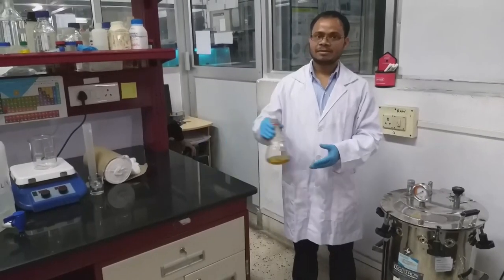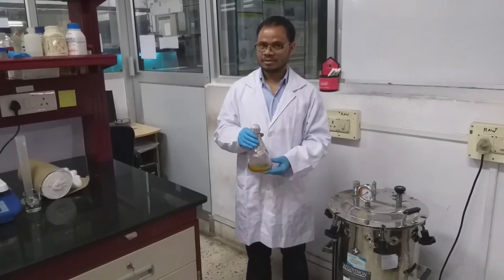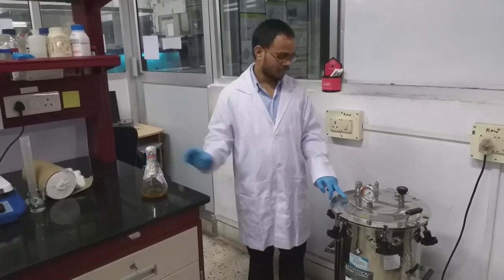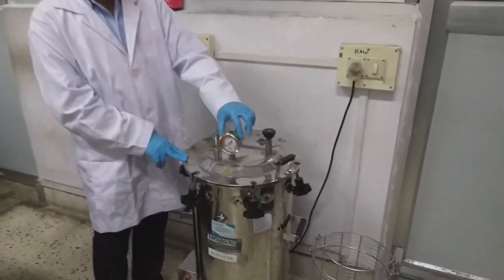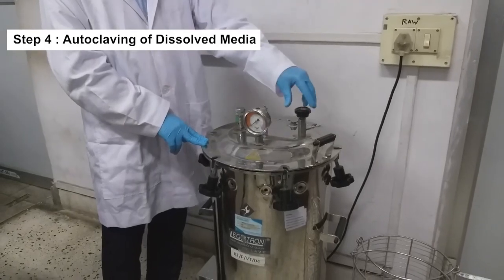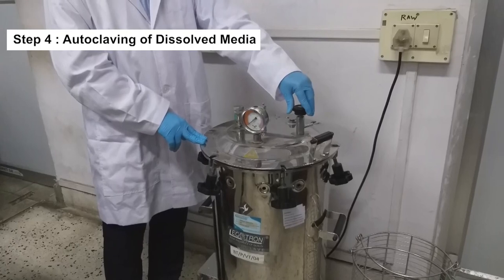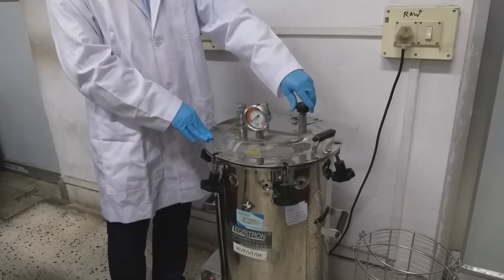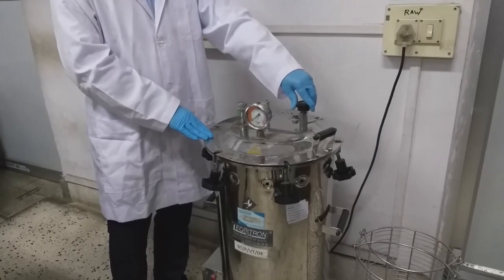Once the media preparation is complete, we have to sterilize the media in order to use it for further applications. This is a typical autoclave where you can see the temperature and pressure indicator, and these are the pressure knobs, and this one is the quick pressure release knob. You can use it when you are in a hurry, but I will prefer not to use this one. Let it go on its way.